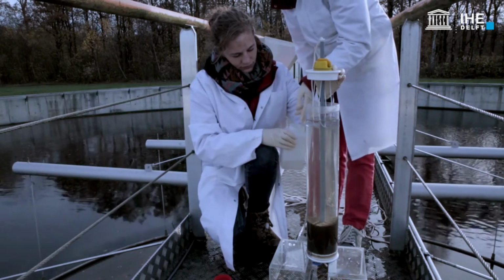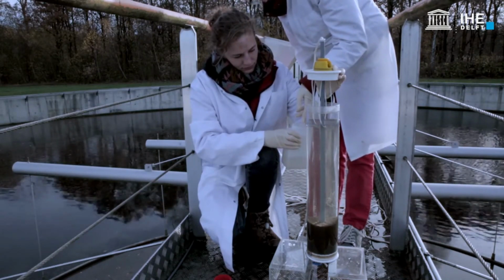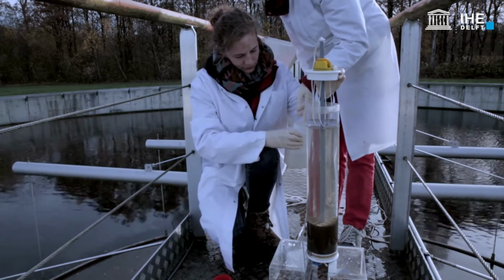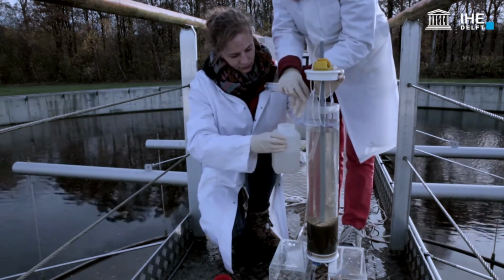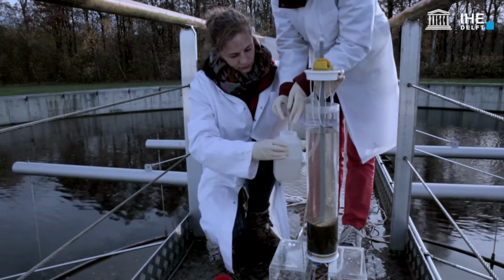Gently pull the syringe. When supernatant starts to flow through the tube, remove the syringe and sample 500 millilitres of the supernatant into a recipient. Analyse the sampled supernatant for suspended solids concentration in the lab.